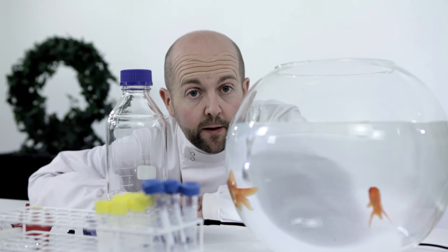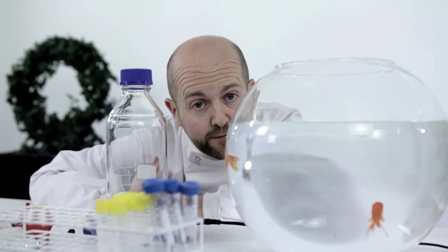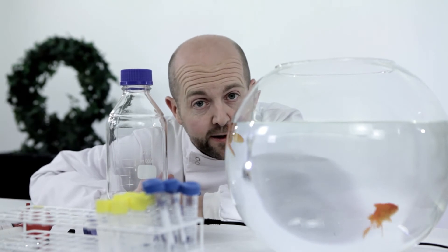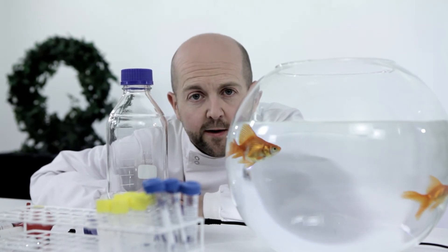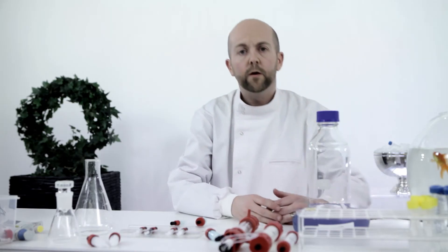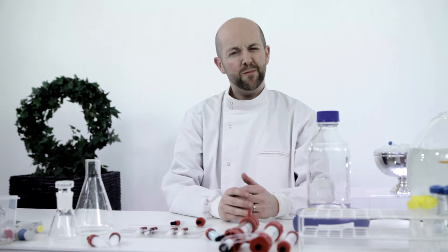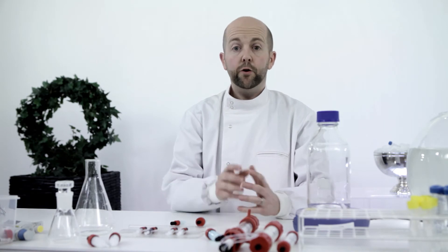Think about viscosity. Fish survive in frozen lakes because water is most dense and viscous at 4 degrees Celsius and sinks to the bottom of the lake so it doesn't freeze. Lucky fish. Your samples are also usually at 4 degrees Celsius and may be very viscous indeed. Simply changing to room temperature for the run might be a good idea. You could also try reducing the flow rate or sample volume.